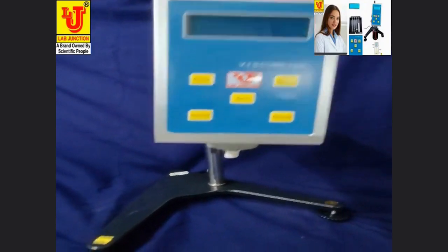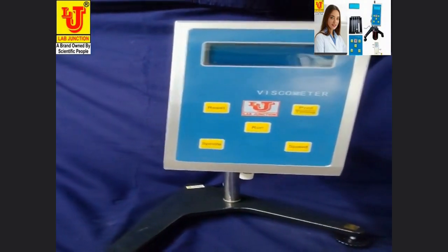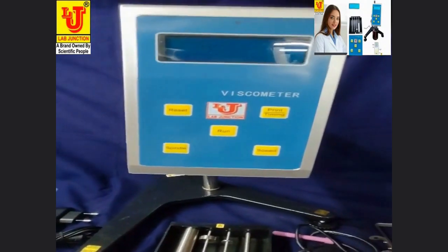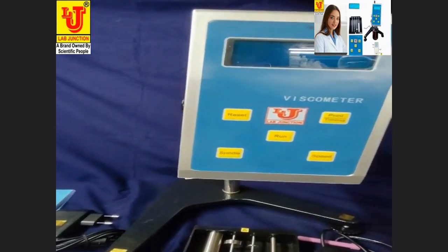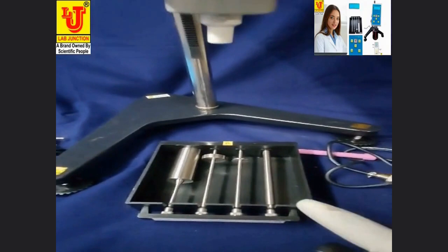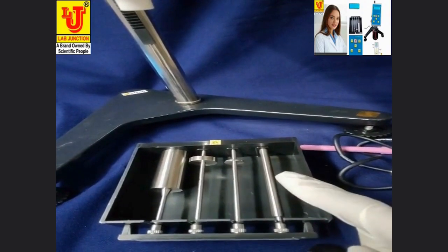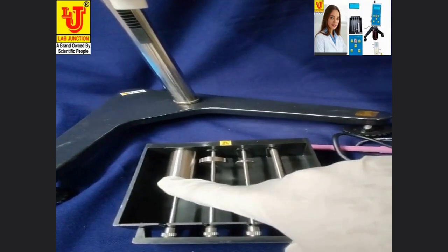In this way you have fixed the display of the digital viscometer on the stand. With this digital viscometer LJ3421, we supply accessories including spindles, four in number.